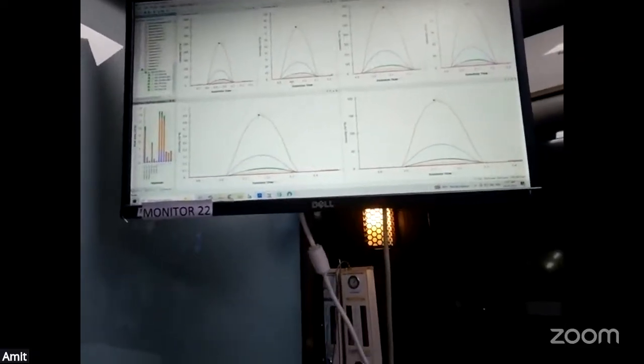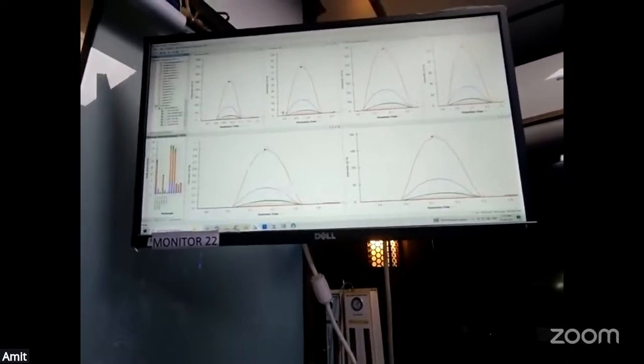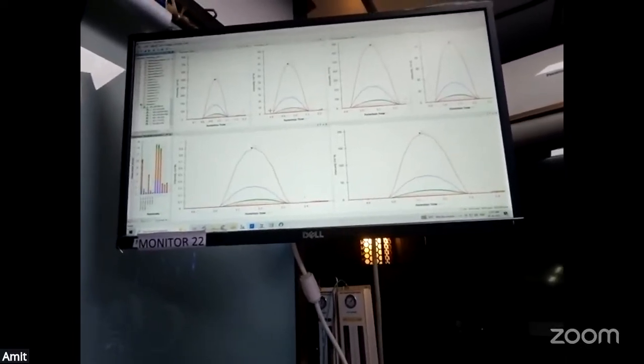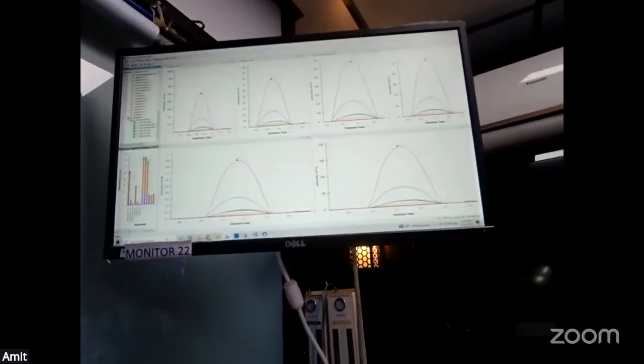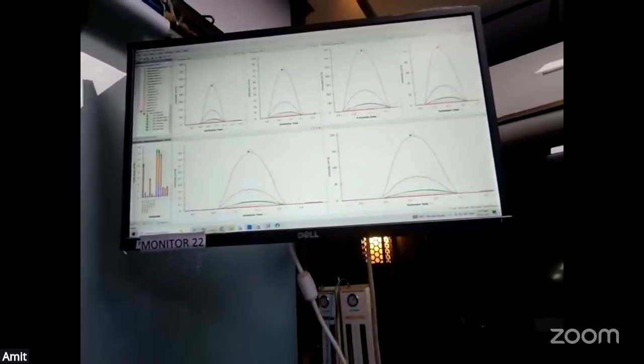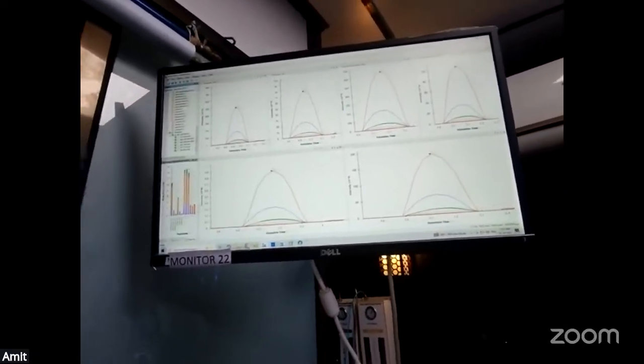In this particular retention time, you have to see whether there is a retention time shift or not. Sam was also mentioning different kinds of QC checks using different iRT peptides or different kinds of standard metabolites. And this is the intensity, which is the peak observed under the area.